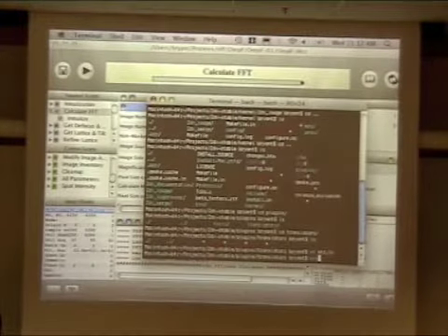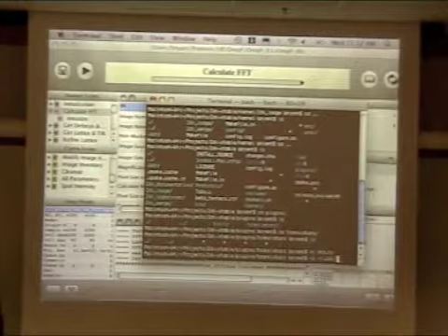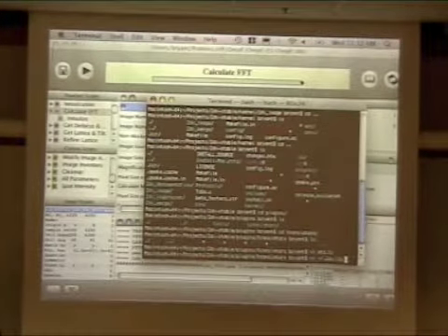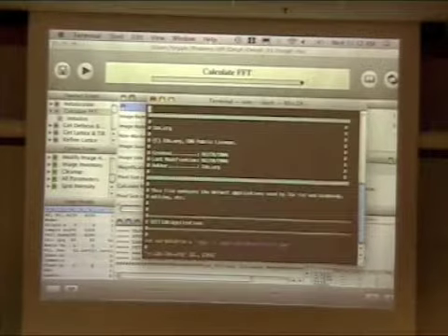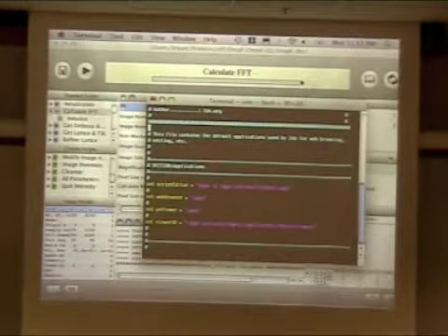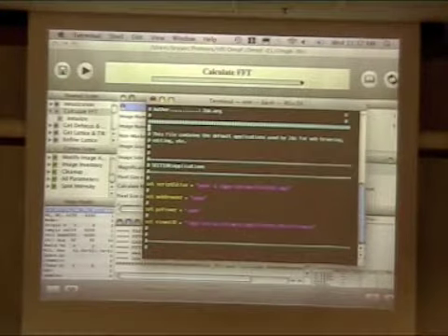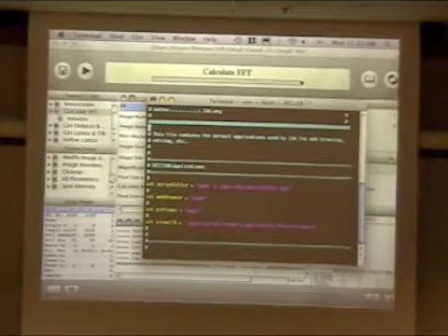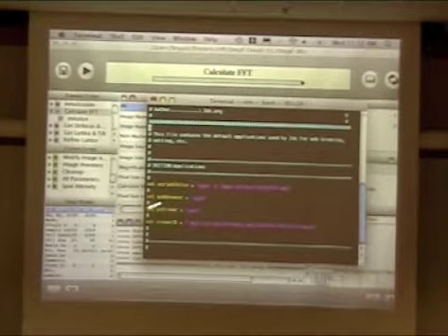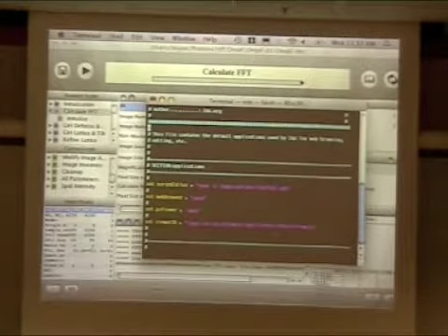You have in your home directory, tilde .2dx, we sort of secretly create a little configuration directory in your home directory, .2dx/2dx.cfg. And this is a major undocumented feature that most people don't know about. It's actually really important, and we need to get it up there. This is the thing that defines how 2dx actually opens links and views postscripts and opens these scripts here when you double click on them.